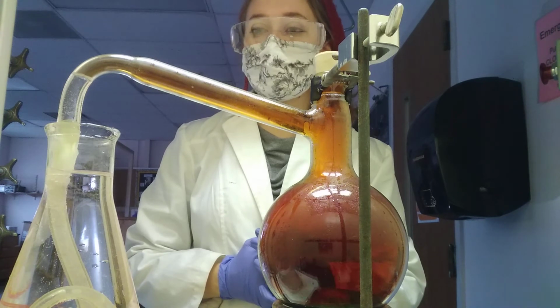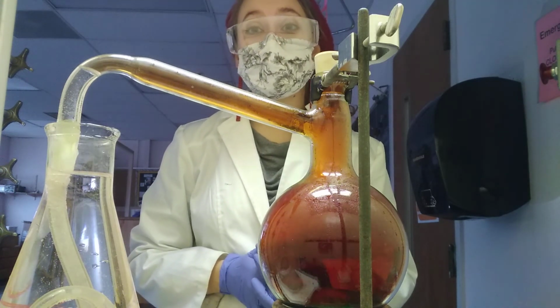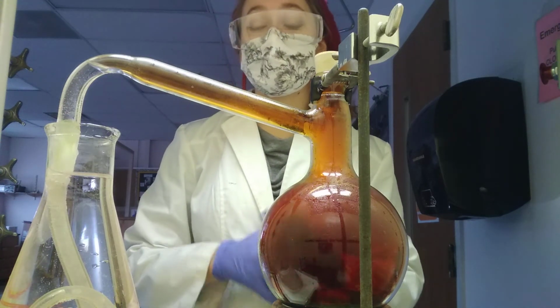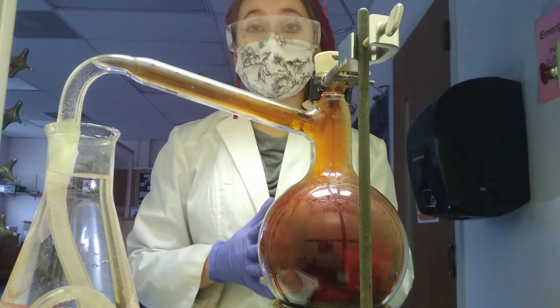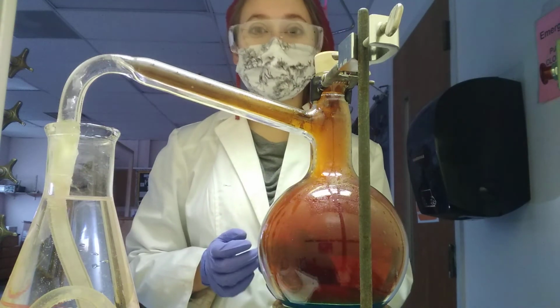Just write that on a piece of paper. You can email me a picture. If you want to send me an email of your apparatus, you can do that too. This is where you should start drawing your second drawing as you see the water begin to trickle down in. What is going to happen?